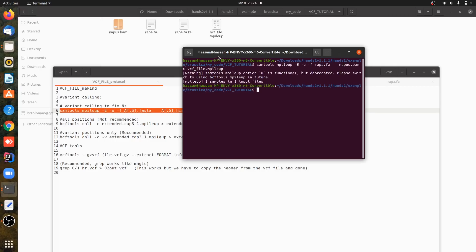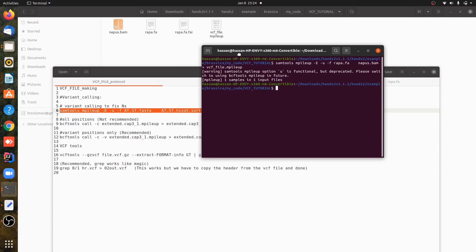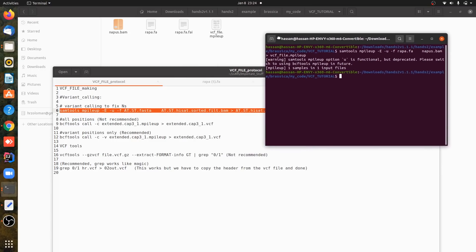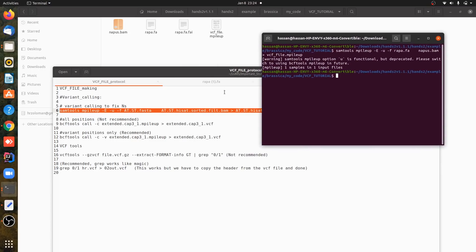Here we can see there are two ways we can get all the variant positions and all the positions. The command for that is this one, but this is not recommended. So next we have to use VCF tools in order to get all the variant positions, only the variant positions.